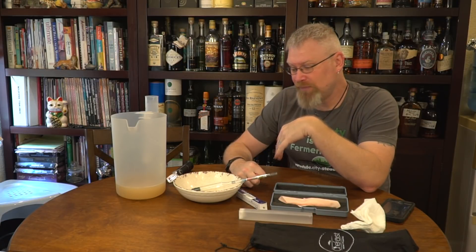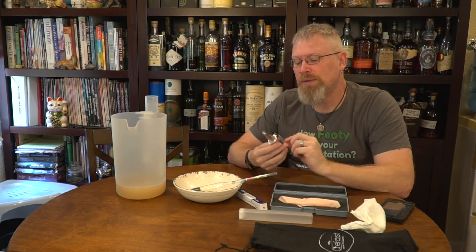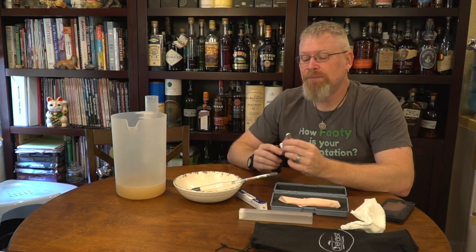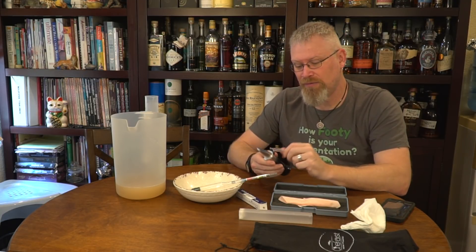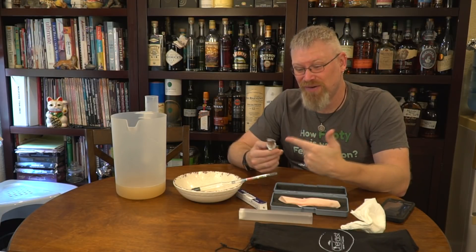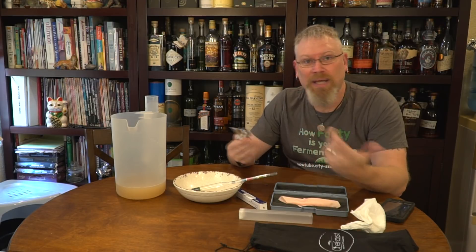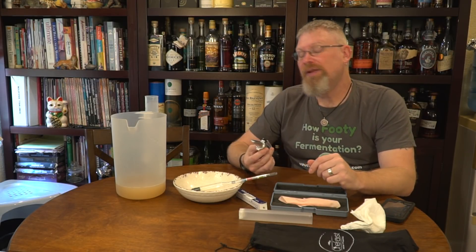The next type of reading is a refractometer. Refractometers can be used, in my opinion, for original gravity only. There is a lot of controversy about them. I started using a hydrometer and then found out about refractometers and thought, why does anybody use hydrometers? You just need three drops, you can measure it, it's really accurate, super cool, and all that. And then I found out one important thing.